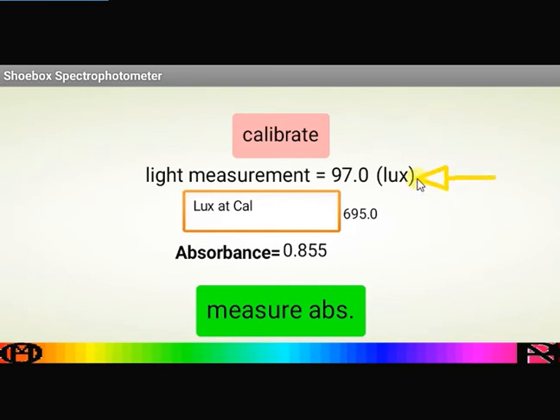This is a real-time light measurement, so it's constantly changing if you move the phone around. But it's quite useful to have this real-time measurement because it's useful in getting your phone in the right position when you're making your shoebox spectrophotometer.